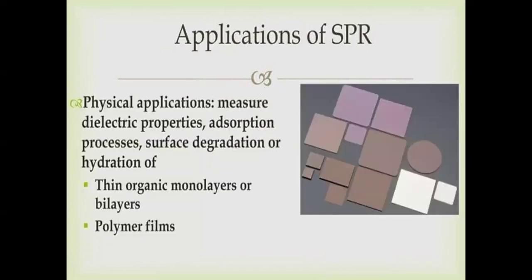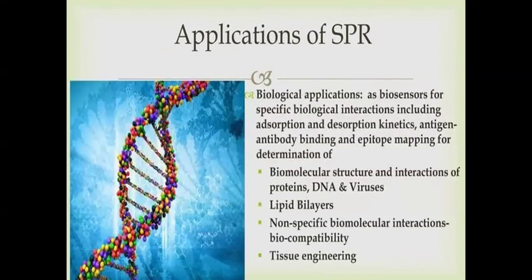Applications are many for this SPR technique. They are being used in dielectrics, in many material making, adsorption processes, but our interest here is on sensors, biosensors. So all the structures like DNA based sensor, virus based sensor, enzyme based sensor, all that can be coated on it.